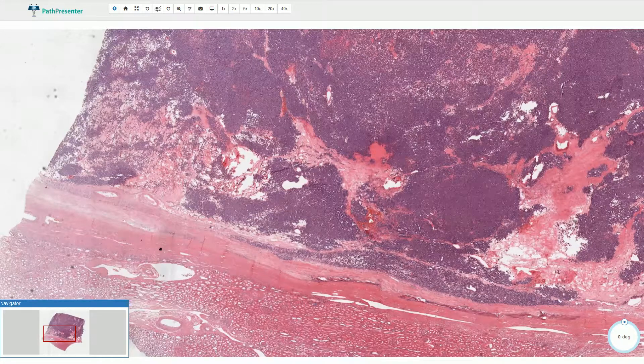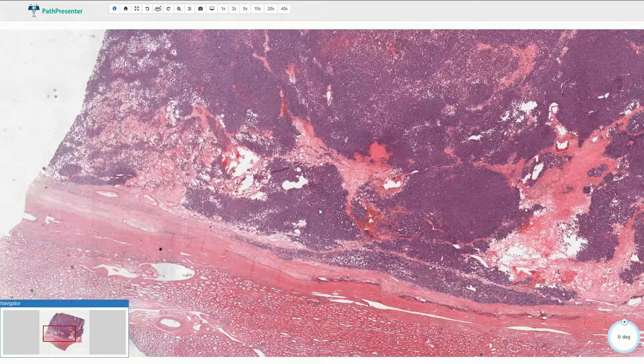Metanephric adenoma is a benign renal neoplasm composed of small primitive cells resembling early metanephric tubular differentiation.